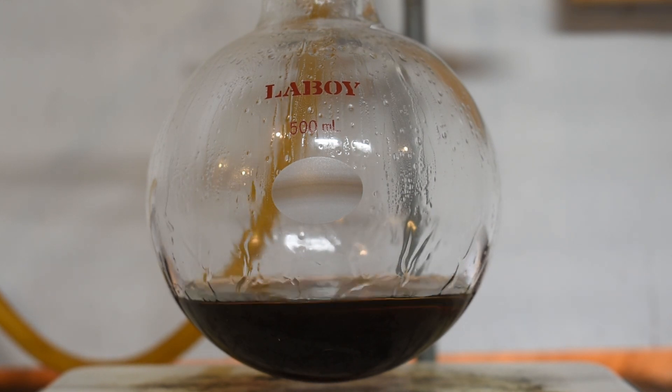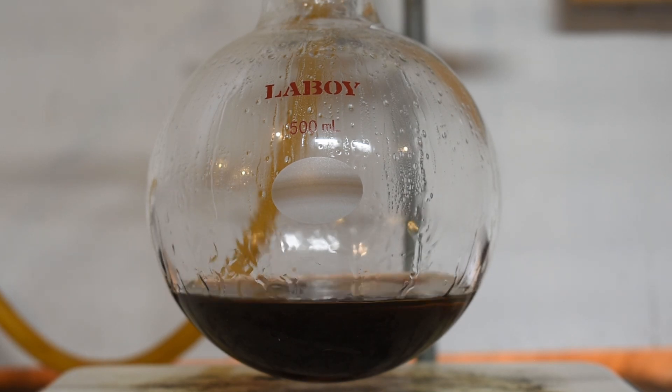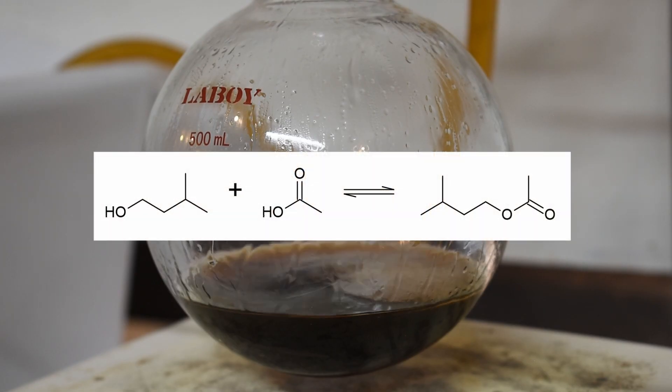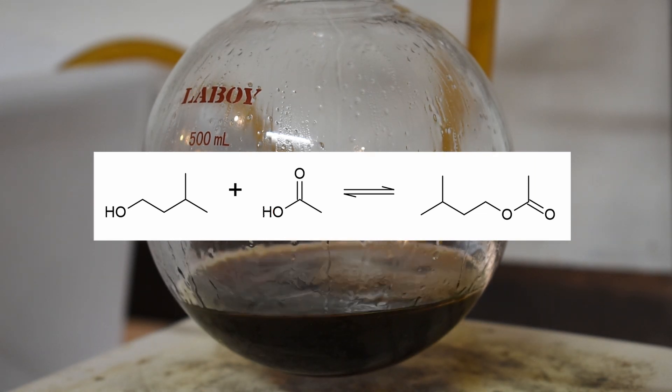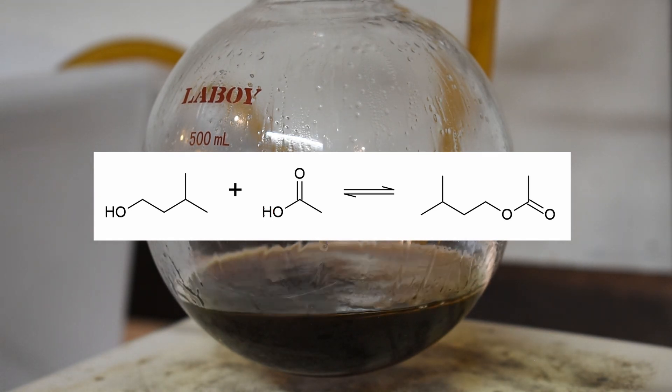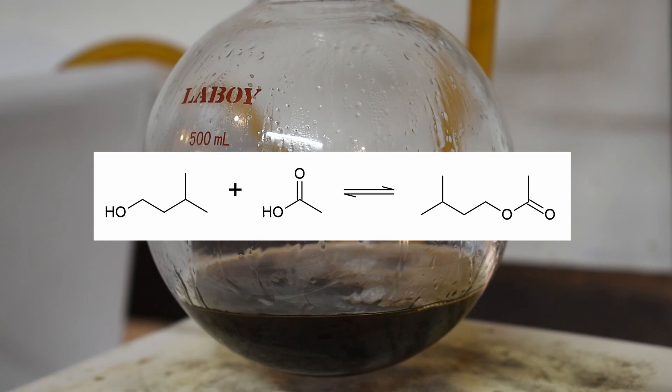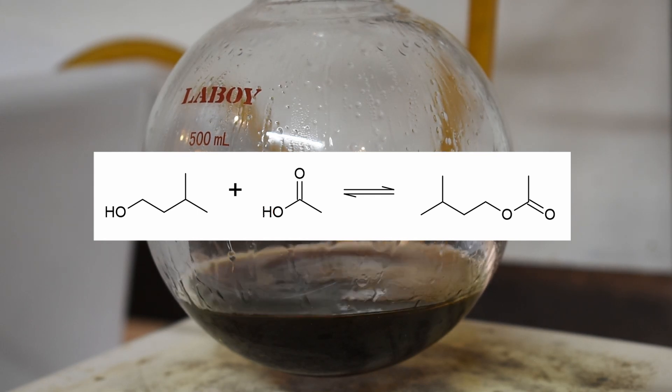I let the mixture reflux for about an hour, but looking back on it, I would probably give it a little bit more time. The reaction taking place here is just a simple Fischer esterification. The acetic acid and the isoamyl alcohol are basically just condensing together. The sulfuric acid with its low pH is helping drive the equilibrium towards our favored isoamyl acetate product.